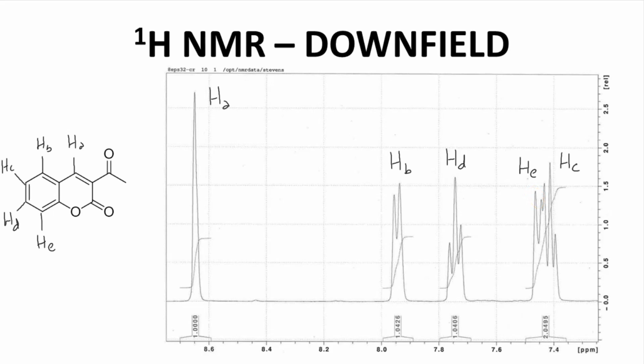This looks fine, but how about the streaking in the TLC and the broad melting range? Do we see evidence of impurities in this spectrum? I would say no, but there are some weak, broad lumps in the aromatic region. Those aren't major impurities, but they might be the origin of the yellow color in the product and some of the TLC streaking and depressed melting point. I think the product looks really nice for a crude product, but this material is certainly not pristine.